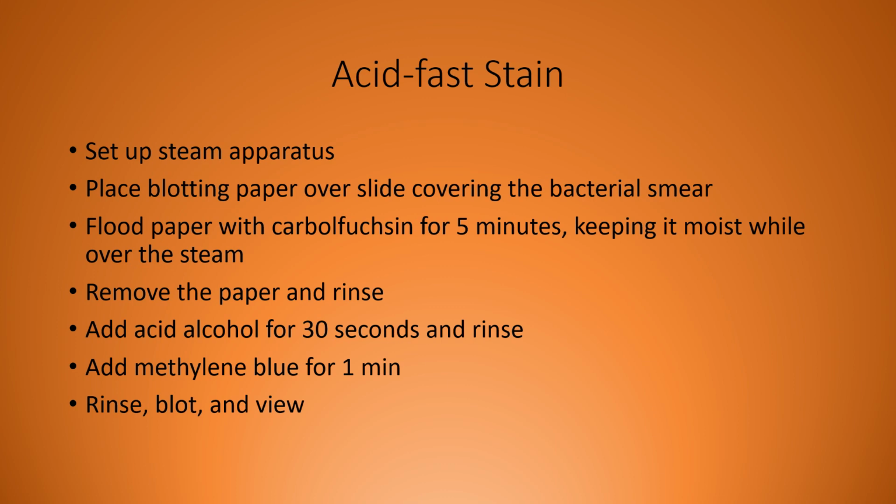Don't walk away. You have to stay there and watch it because you do not want the blotting paper to dry out. So every time it starts to look like it's dry, add more carbolfuchsin to keep it moist. So it needs to remain moist that whole 5 minutes. After 5 minutes, carefully, you remove the blotting paper and dispose of it.